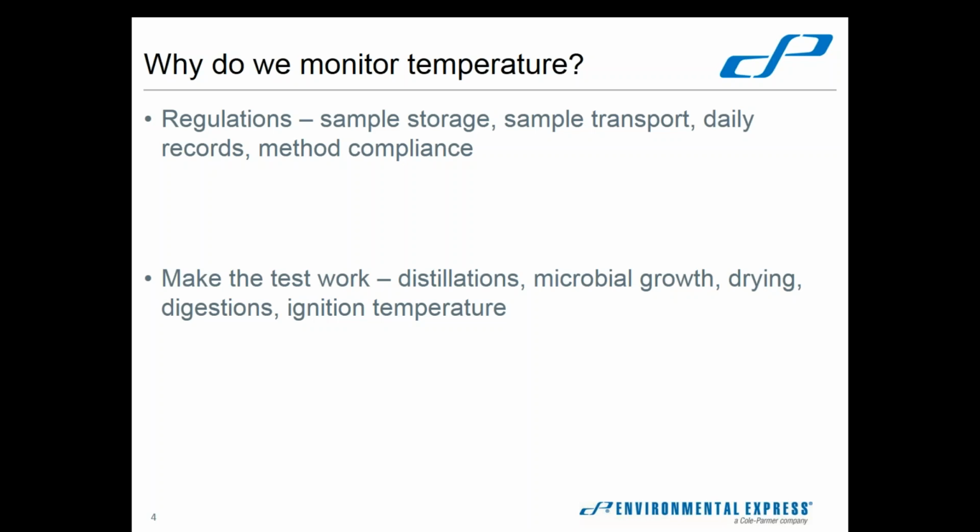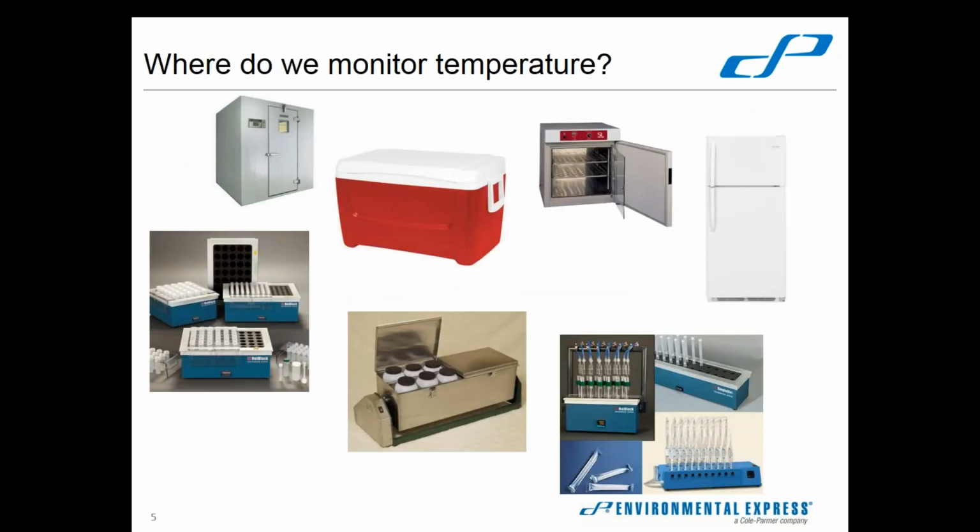Or if you happen to be lucky enough to do a BTU or an ignitability test, temperature monitoring is a very important part of those processes. There are probably other reasons to monitor the temperature, but these are the two main ones, and they're probably the most relevant to us and what we do on a daily basis in our job.